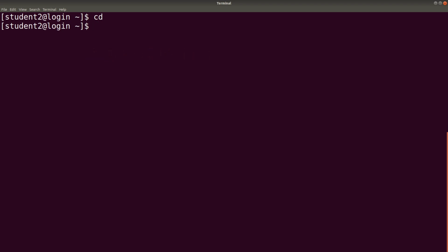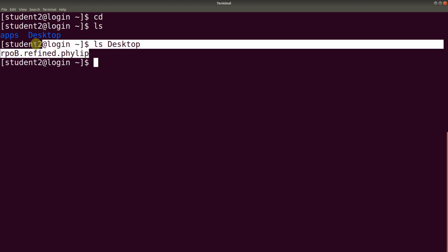The data set is on my desktop. So this is my desktop. So I'll now list the content of it as well. So I'll say ls Desktop. So there is the file.